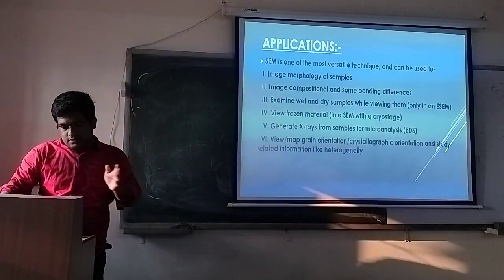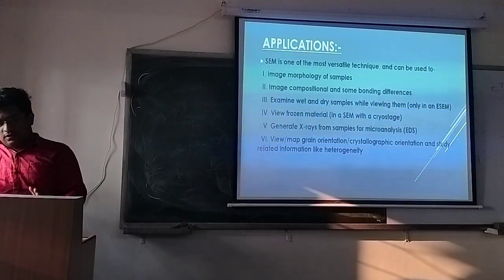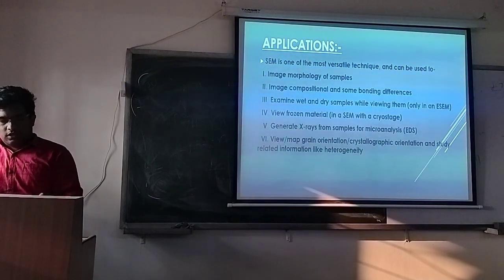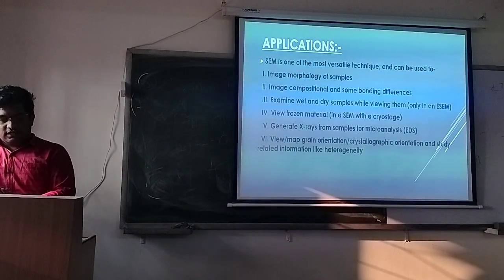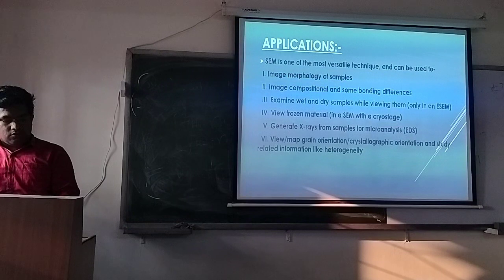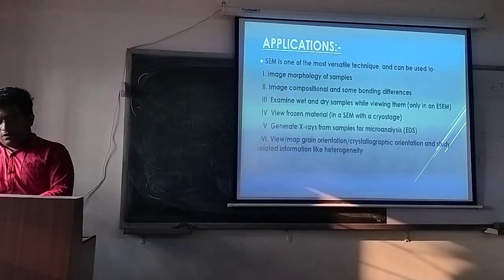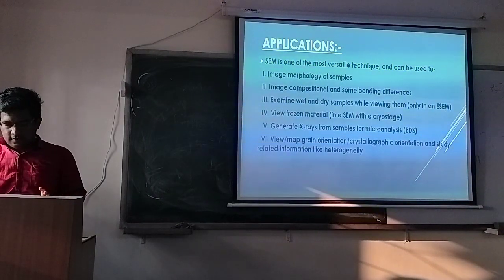These are the applications. SEM is one of the most versatile techniques, and can be used to image the morphology of the sample, image composition and bonding, examine wet and dry samples, view frozen material, generate X-rays from the sample for microanalysis, and view the grain orientation and crystallography orientation, and study related information like heterogeneity.